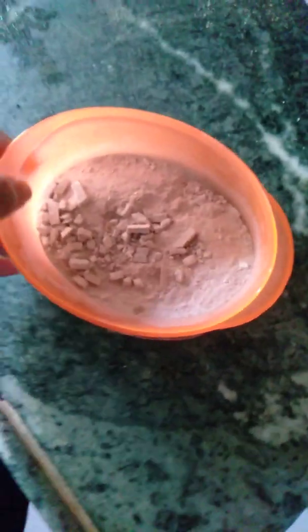Today we will do an interesting experiment of making calcium oxide from this calcium carbonate. This is the yield of calcium carbonate that I have got from the chalks, and now we will put this in this container and heat it for obtaining our nice yield of calcium oxide, and we will store it in this bag. So let's start.